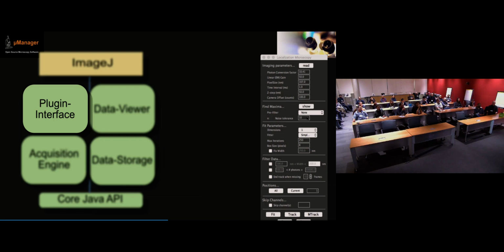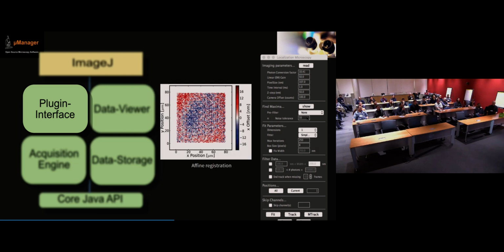Our lab does a lot of single molecule tracking, so that stuff is all built in, and at the moment we're getting a lot out of it because we also put 2-color registration in here. A student in our lab, Stefan, worked this up to a system in which he can measure distances between 2 single molecules of different colors at nanometer resolution.